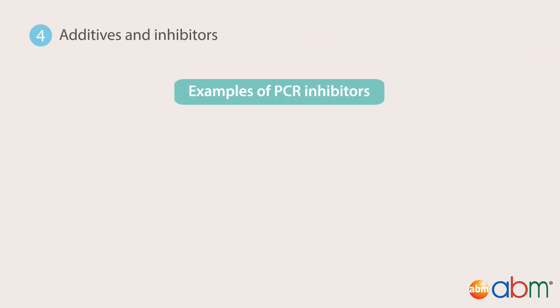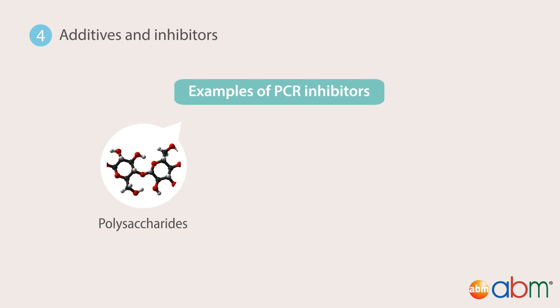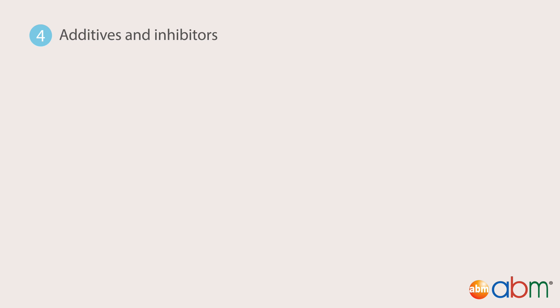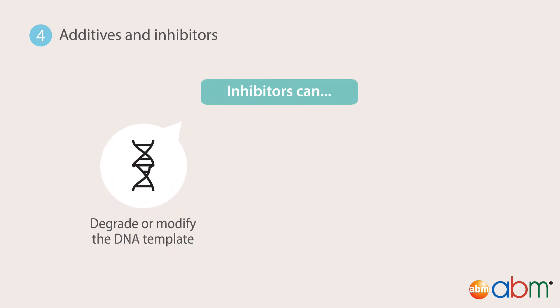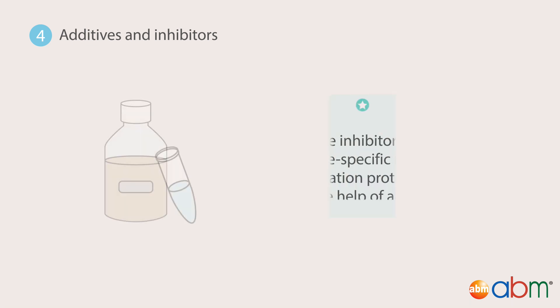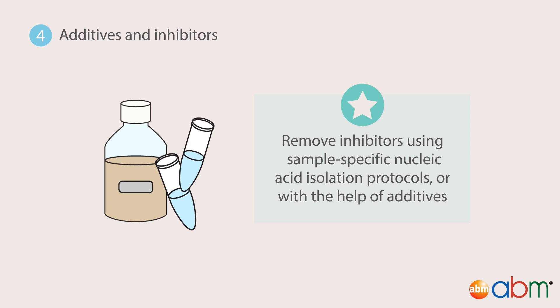Many naturally occurring substances such as polysaccharides, tannic acid, and EDTA can also inhibit PCR. Some inhibitors may degrade or modify the DNA template, while others can disturb the annealing of primers to DNA or alter the DNA polymerase activity. Inhibitors can be removed with sample-specific nucleic acid isolation protocols, or sometimes the use of additives can help in reducing the inhibition.